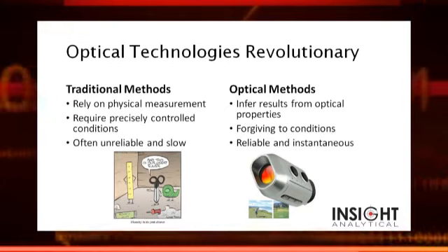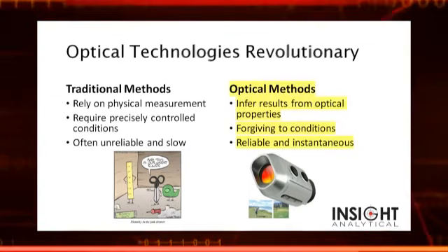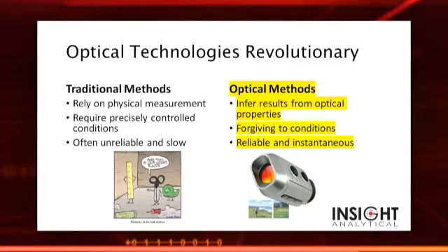What's potentially revolutionizing our ability to do this is optical technologies. We've seen a huge change in the semiconductor industry and in the communications industry. What it's brought to us is new laser technologies, new detector technologies, and new optical manufacturing technologies that allow us to build spectrometers that are stable, robust, and do amazing measurements in real time. I mean, think about what we do for distance measurements. You used to walk around with a tape measure, and now we just take a little gun and shoot it against the wall, and it tells me it's exactly 18.2 feet away. So we've seen all these technologies come into our everyday life.